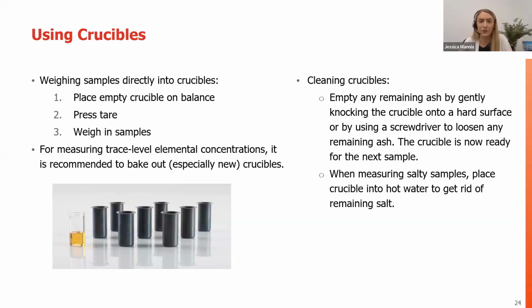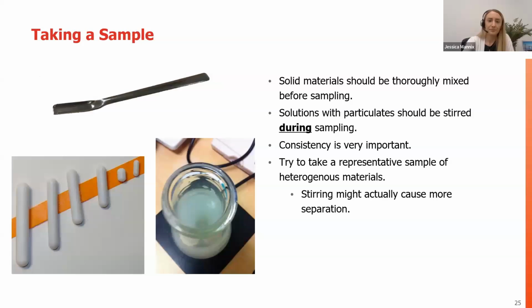Some people, if it's really difficult to remove, if you've used it time and time again without knocking that ash out, just use maybe a screwdriver to remove or loosen up the ash. If you're working with a very salty application, salty samples, the crucibles themselves, these photographed here at least, are made of steel. And since salt is water soluble, we can just toss them in a water bath without any concerns. This goes for both the crucibles and the tinfoil sample preparation options.